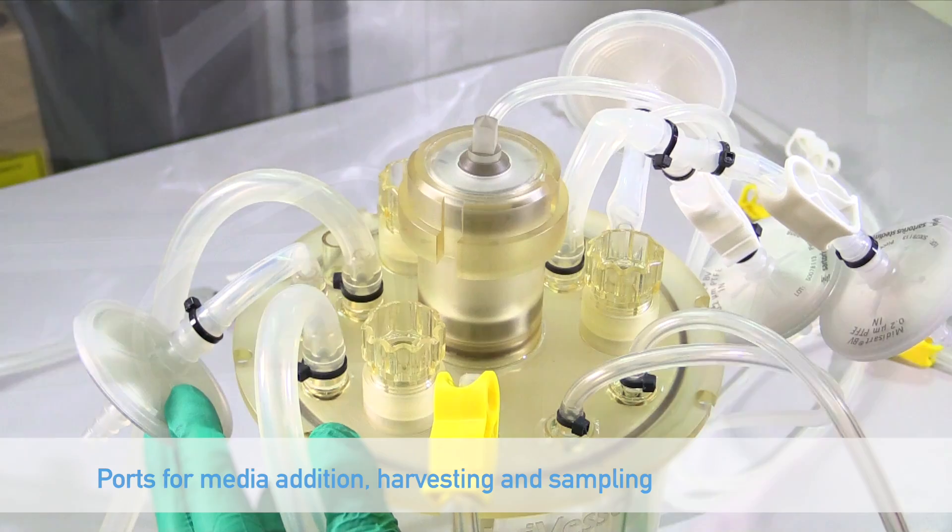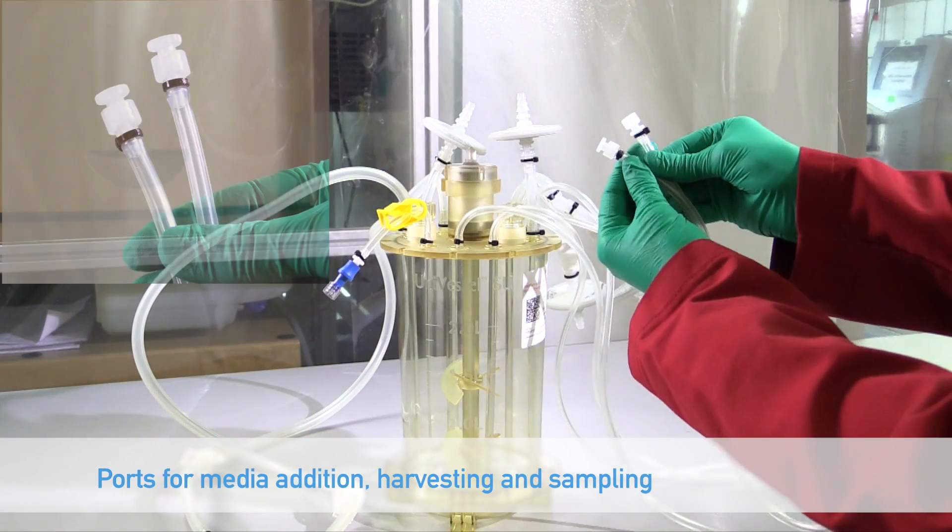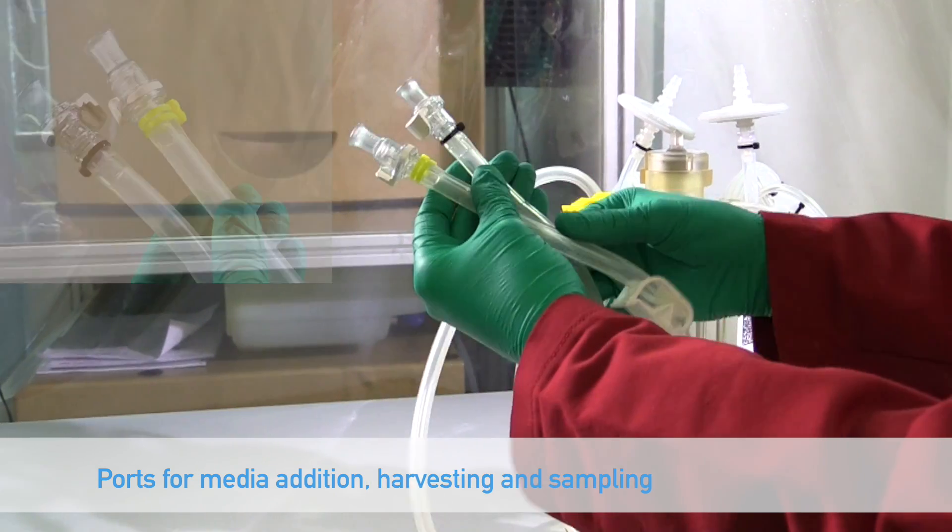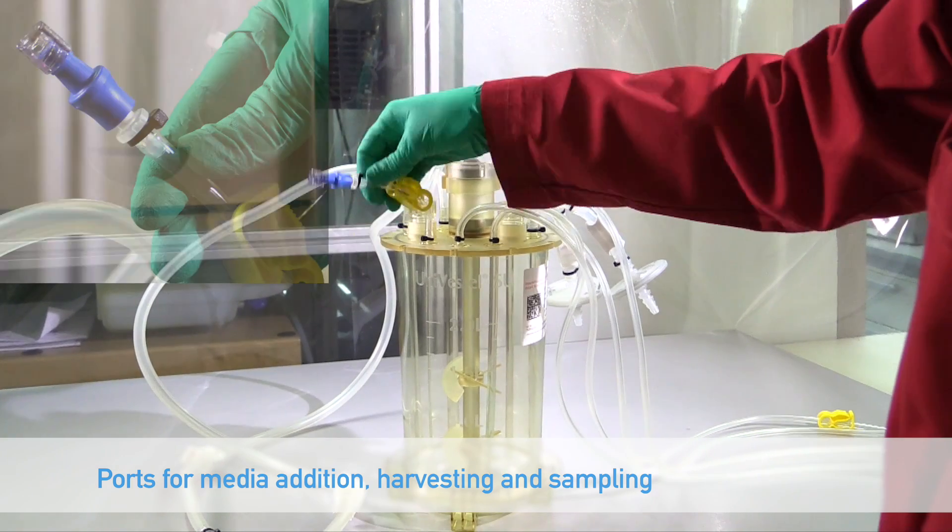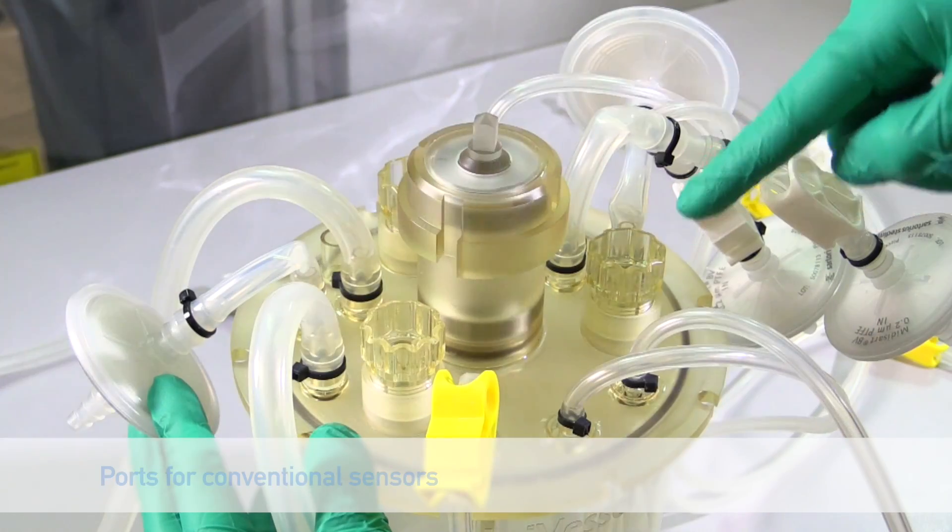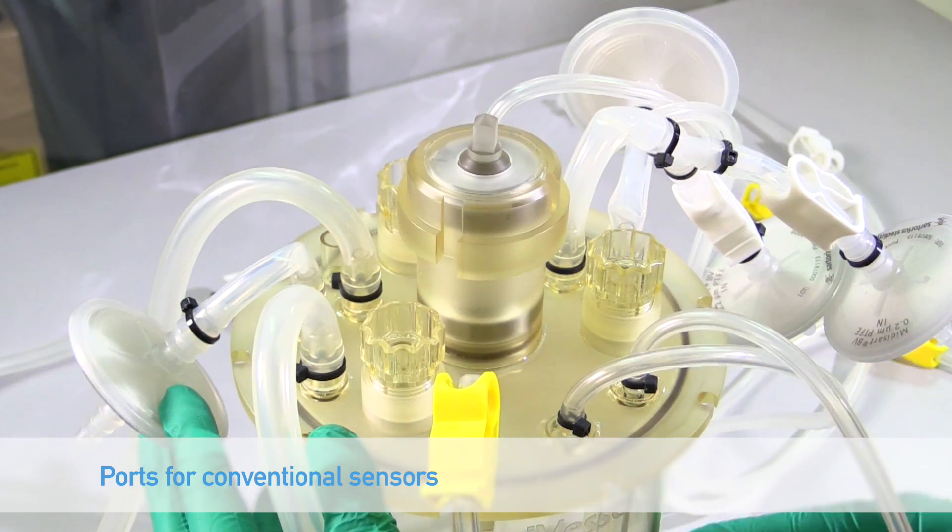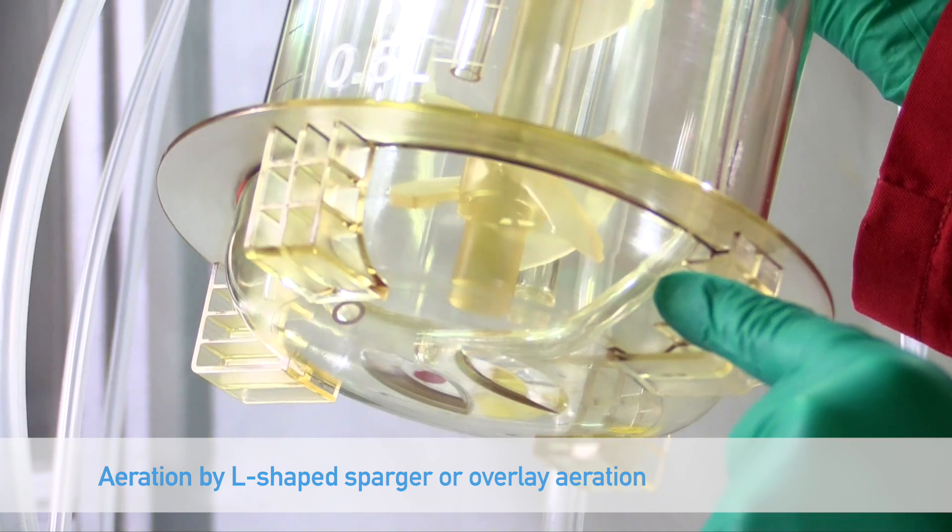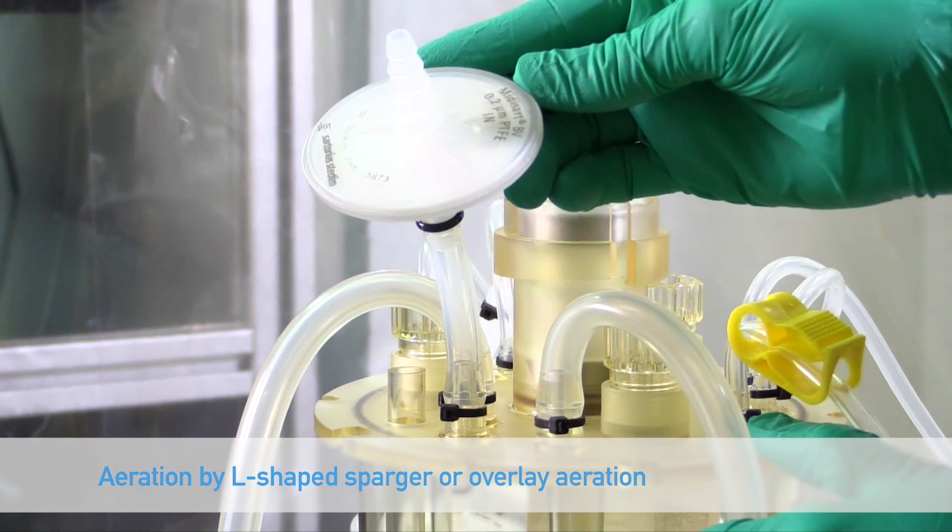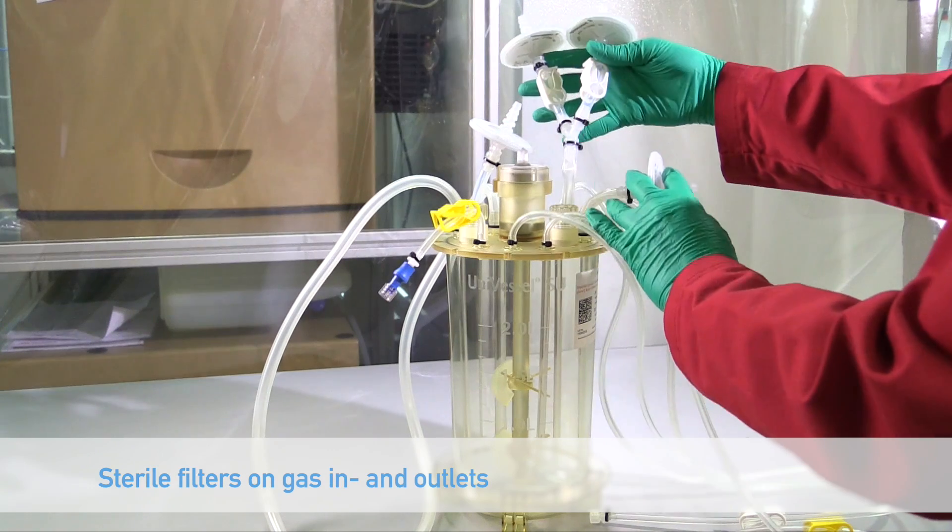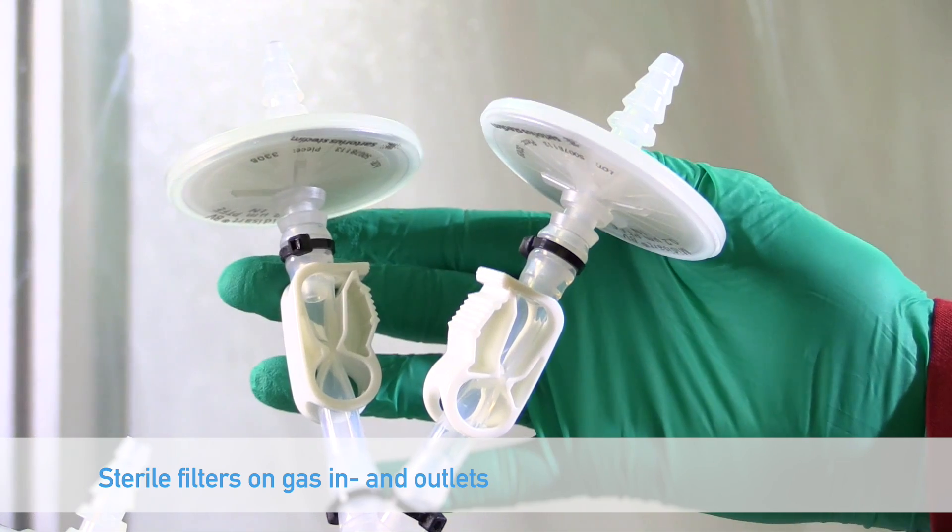On the vessel's lid, there are various ports for media addition, harvesting and sampling, and three ports for the insertion of conventional sensors. Aeration is possible using the L-shaped sparger or overlay aeration. Both air inlets and outlets are equipped with sterile filters.